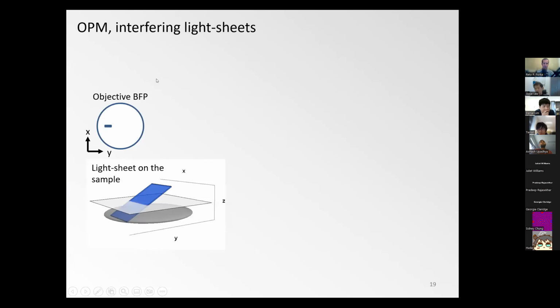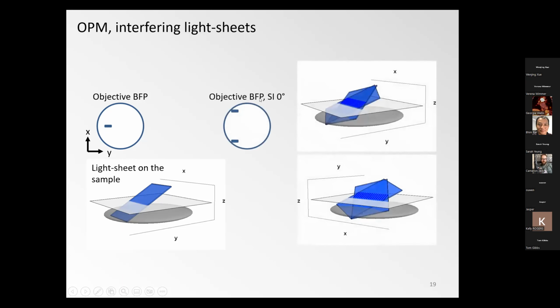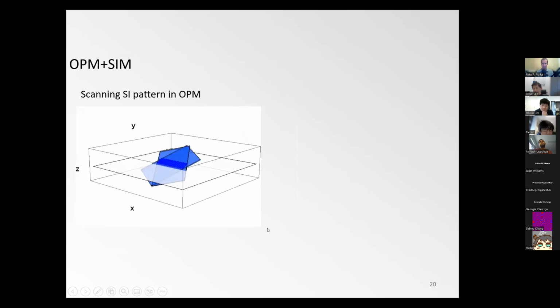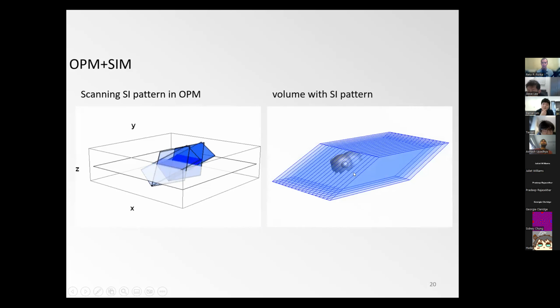And so this is how it would look like. So in the normal OPM, in the pupil, you have a line that is a bit displaced to the left. If that line were in the middle, there would be a light sheet coming straight out. If it's a bit displaced to one side, it creates a tilted light sheet, schematically shown here, as it comes out of the objective. And for the structured light sheet, we essentially use 2 line segments at the very edge or the periphery of the pupil. And they would essentially create 2 light sheets that propagate in the same plane, but are angled to each other. And when they're coherent, they would form this interference pattern. And then in the OPM geometry, we can scan them with the Galvo, and as such, acquire a volume, or more precisely, a parallelepiped volume of the sample under structured illumination.